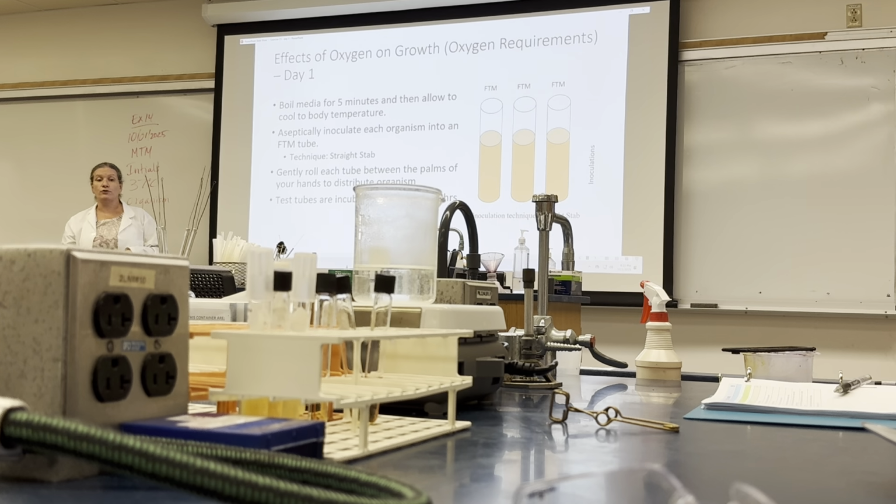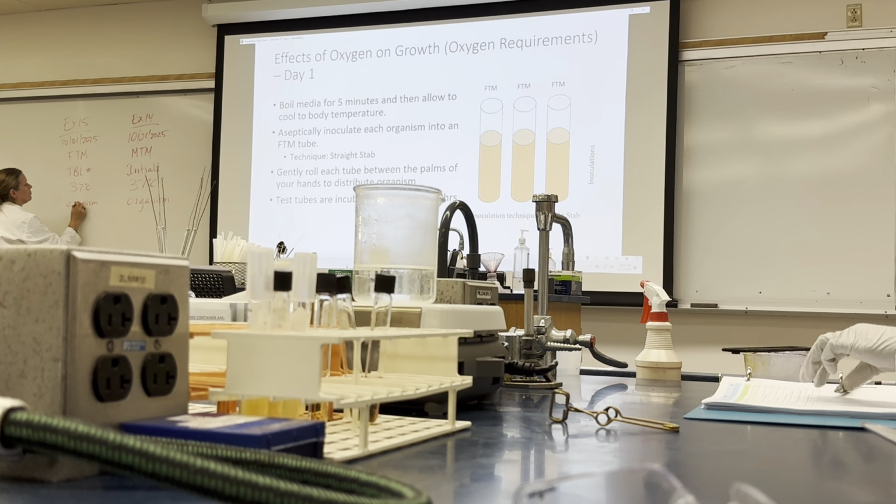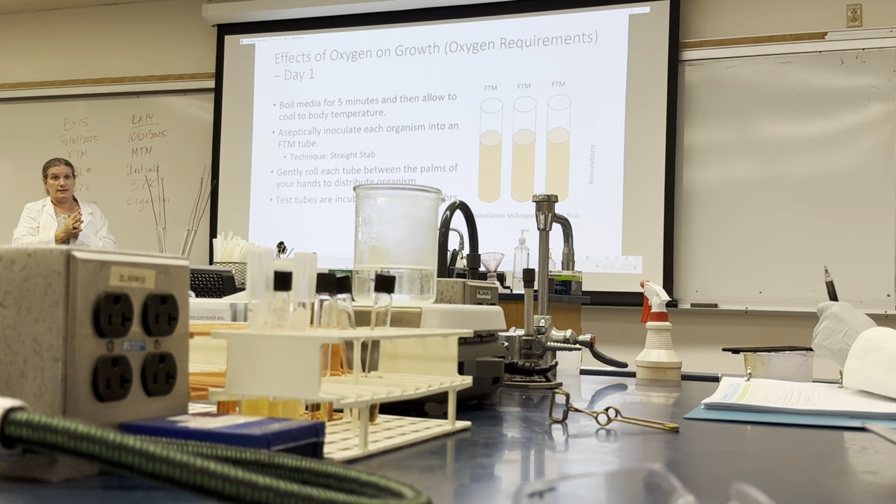This is going to be incubated at 37. You're going to put it on the white rack that's sitting next to these tubes, right? And the label, in this case, is table-based. So we're working at the table on this one. FTM media, and we put the table number, 15. It's still 37 degrees Celsius, and the organism. Okay, that's the extent of this one.